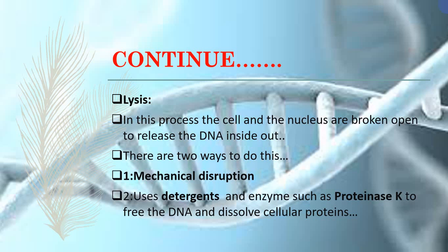The first method is mechanical disruption. For mechanical disruption, we usually use grinders or crushers, any type of mechanical method which can break down the cell into pieces.